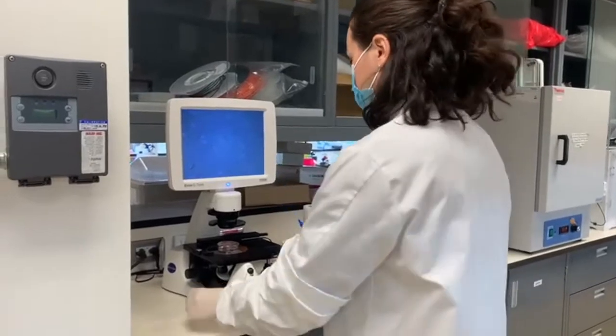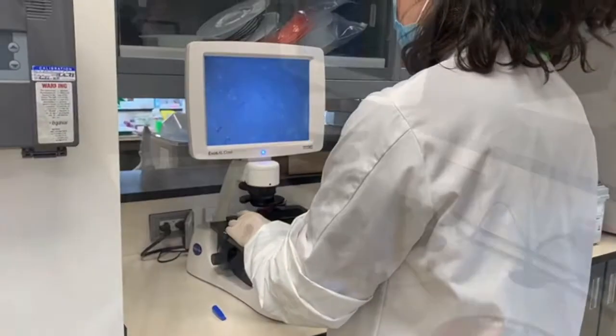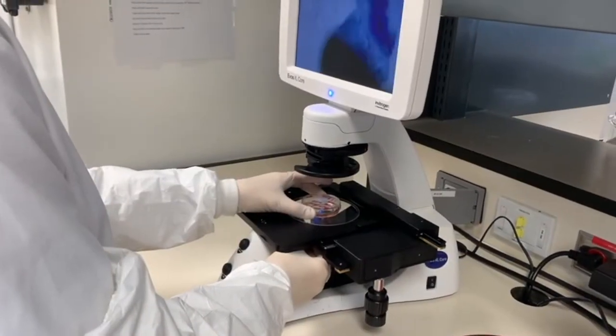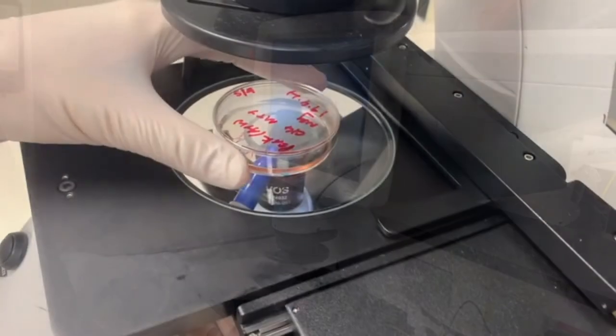Start by choosing a permanent marker to use for the procedure. Place the dish under the microscope and carefully put the pen under the dish and above the lens.